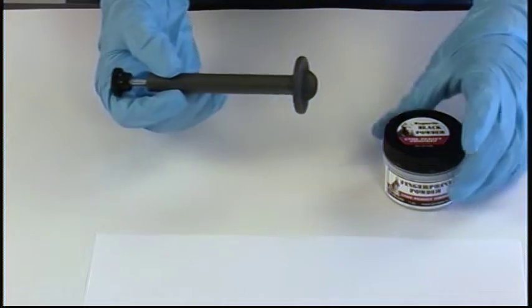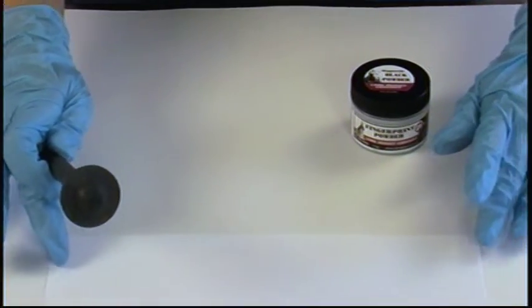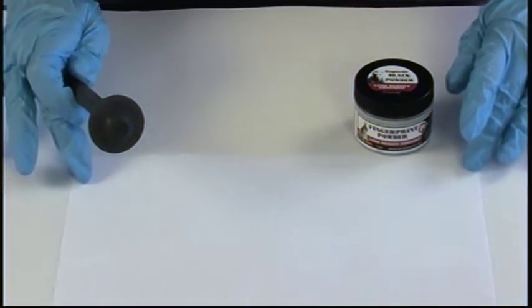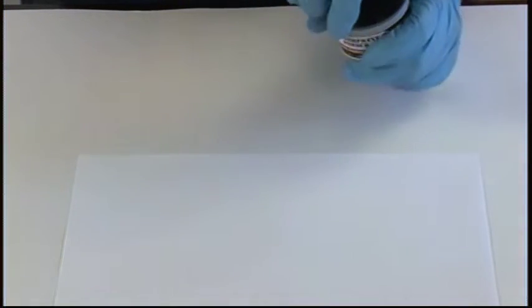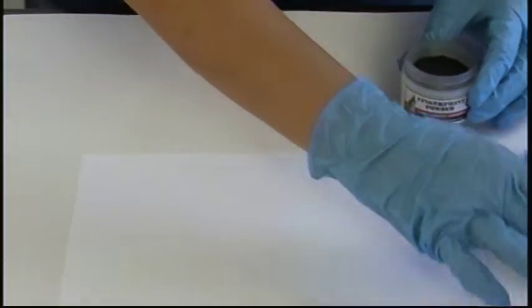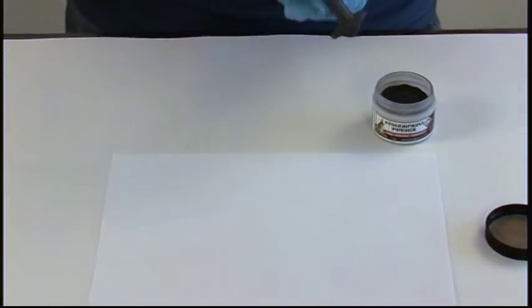We're going to start with it depressed so we can pick up our powder. On this blank sheet of white paper, we have some fingerprints to develop. Let's open up our powder, and with the plunger depressed so the magnet is at the base, pick up a fair amount of magnetic powder.